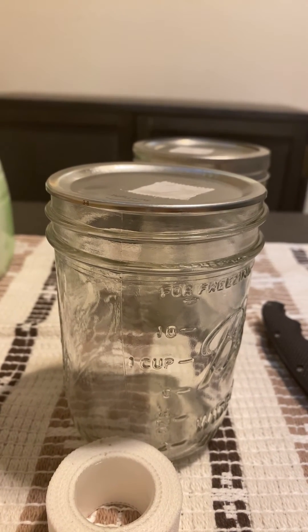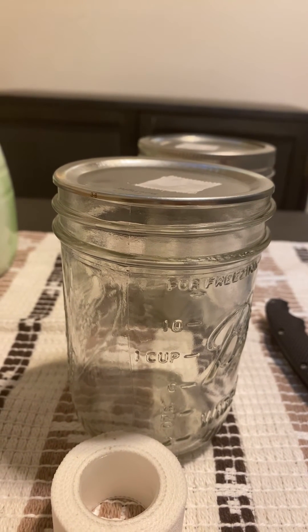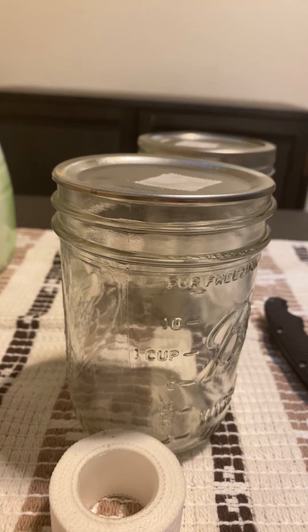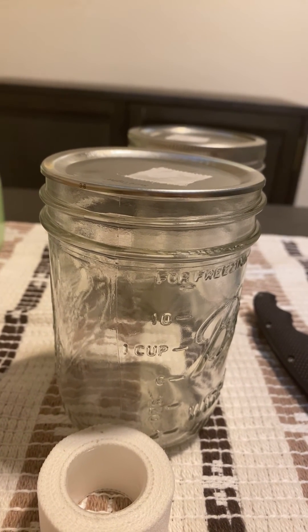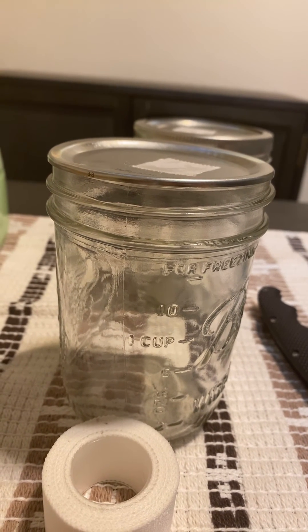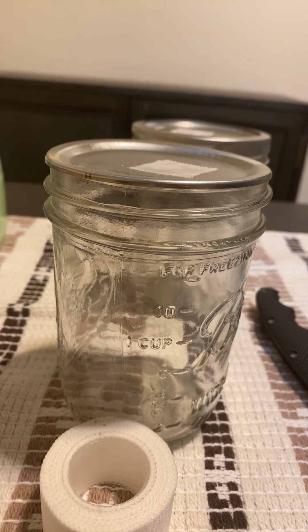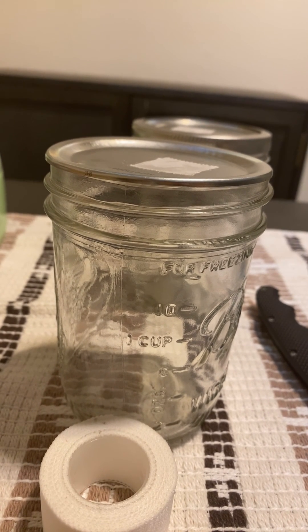I'm probably going to be taking a video of me doing that tomorrow. Let me know if you guys are interested in more cultivation videos. Very simple — inoculating grain spawn into these pint jars for grain-to-grain transfers. Simple as that. Alright, take it easy.